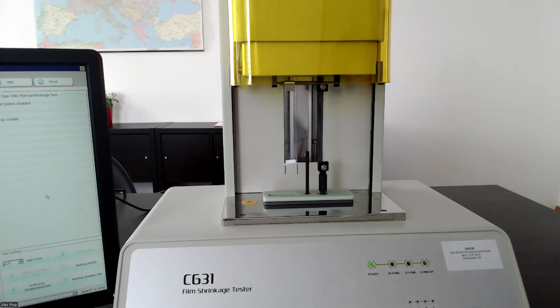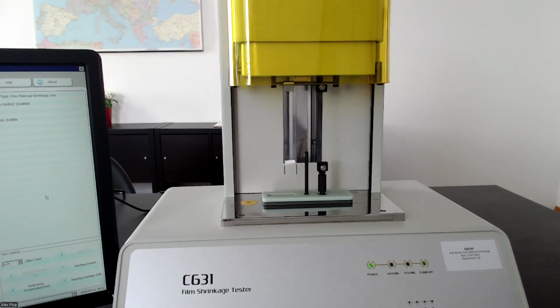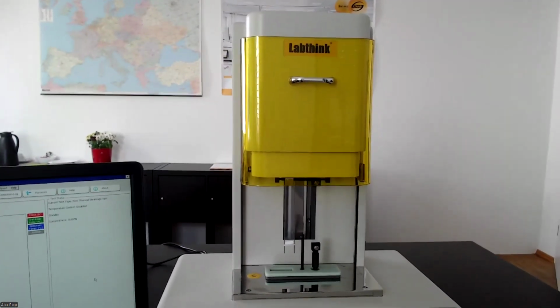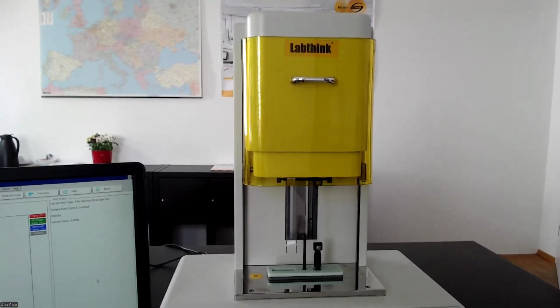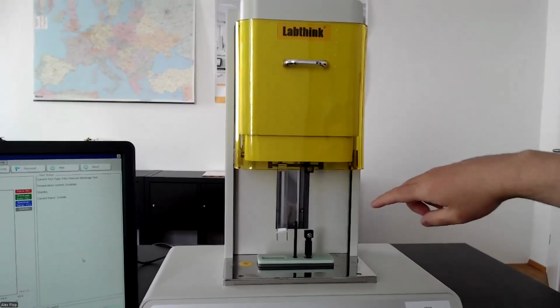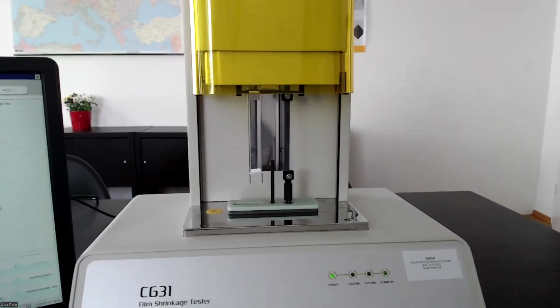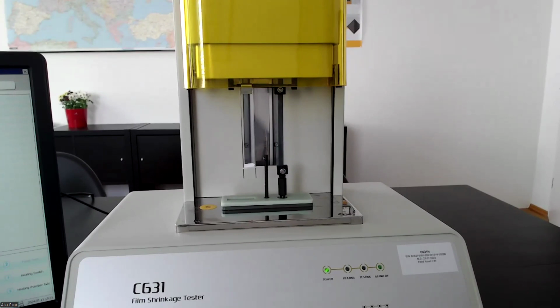Here the incubator door will fall down as needed when we start a test, because we get a lot of questions about what is happening in the middle. This is the sensor that monitors the actual temperature inside to know exactly when the desired temperature is reached.